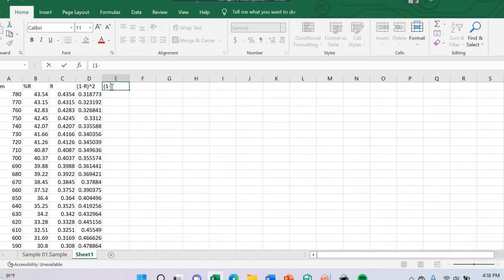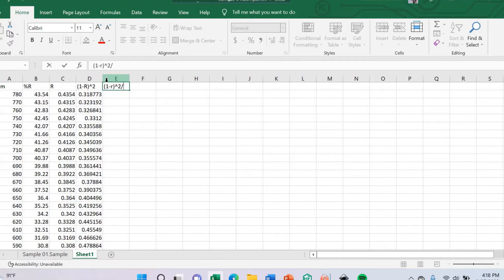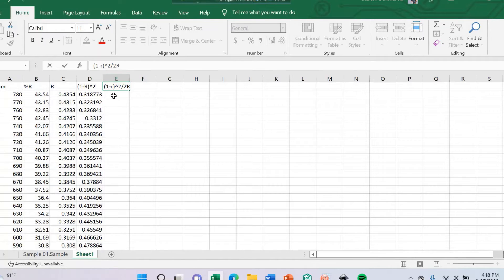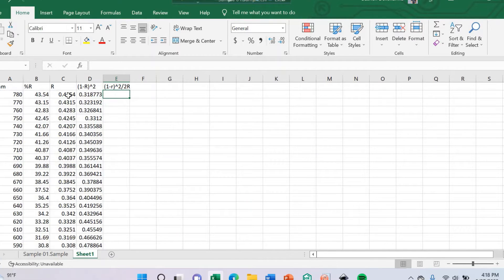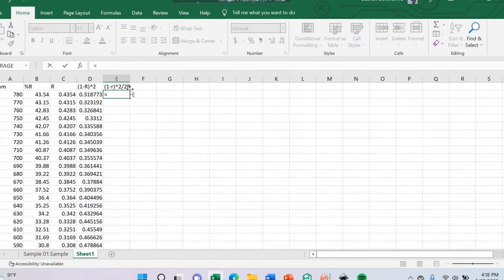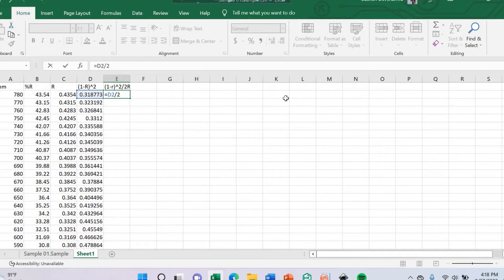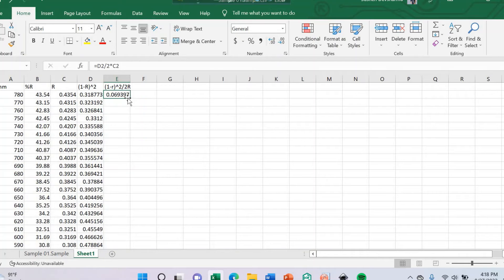We can convert this reflectance into absorption coefficient using the Kubelka-Munk formula: (1 minus R) squared divided by 2R. This gives us my absorption coefficient.